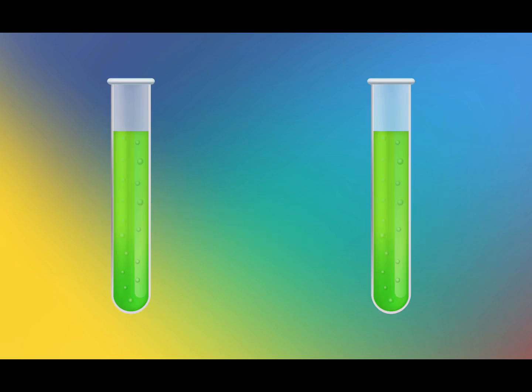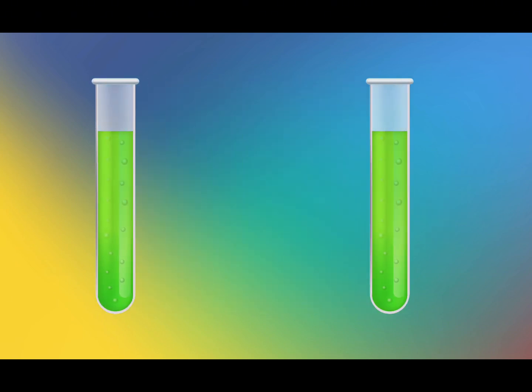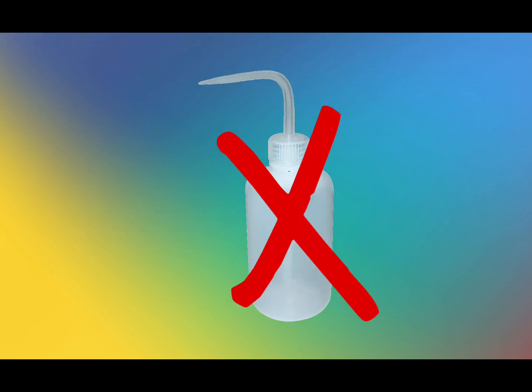Overall, our lab was successful, but there were times of human error, like when we switched test tubes 3 and 4. Our group decided to switch the tubes back in hopes that they were just mixed around in order. Another example of an error was when we forgot to add water before mixing and had to mix again after adding water. Wait, there's water?